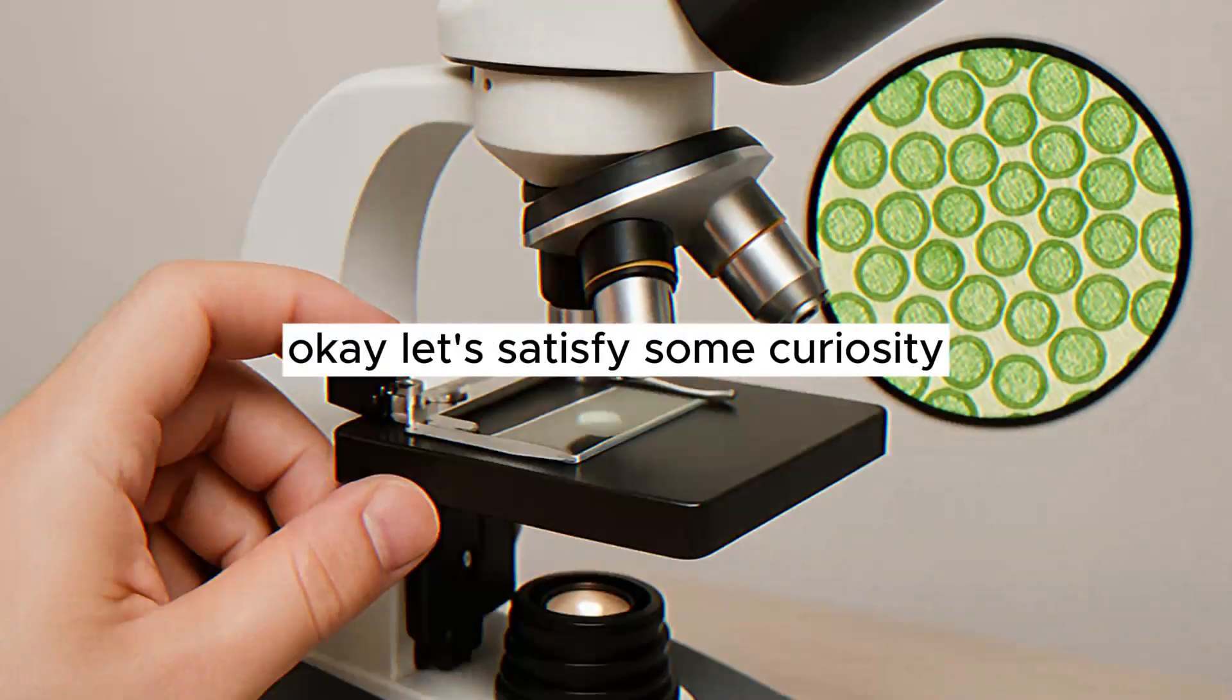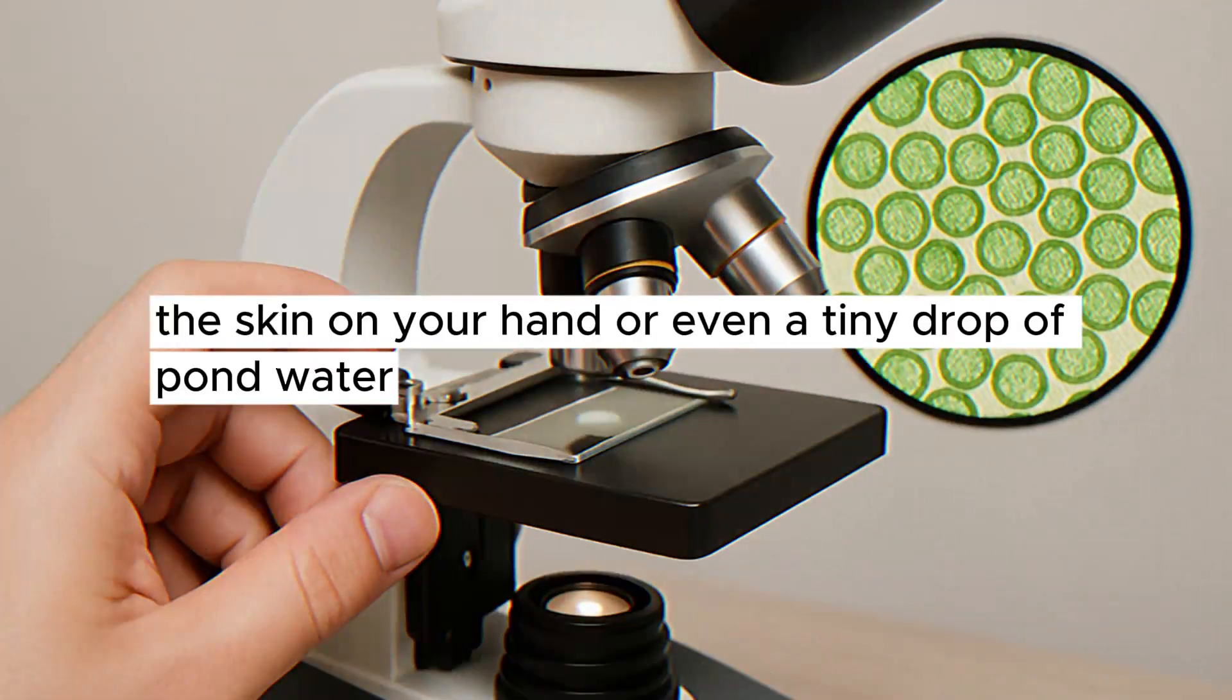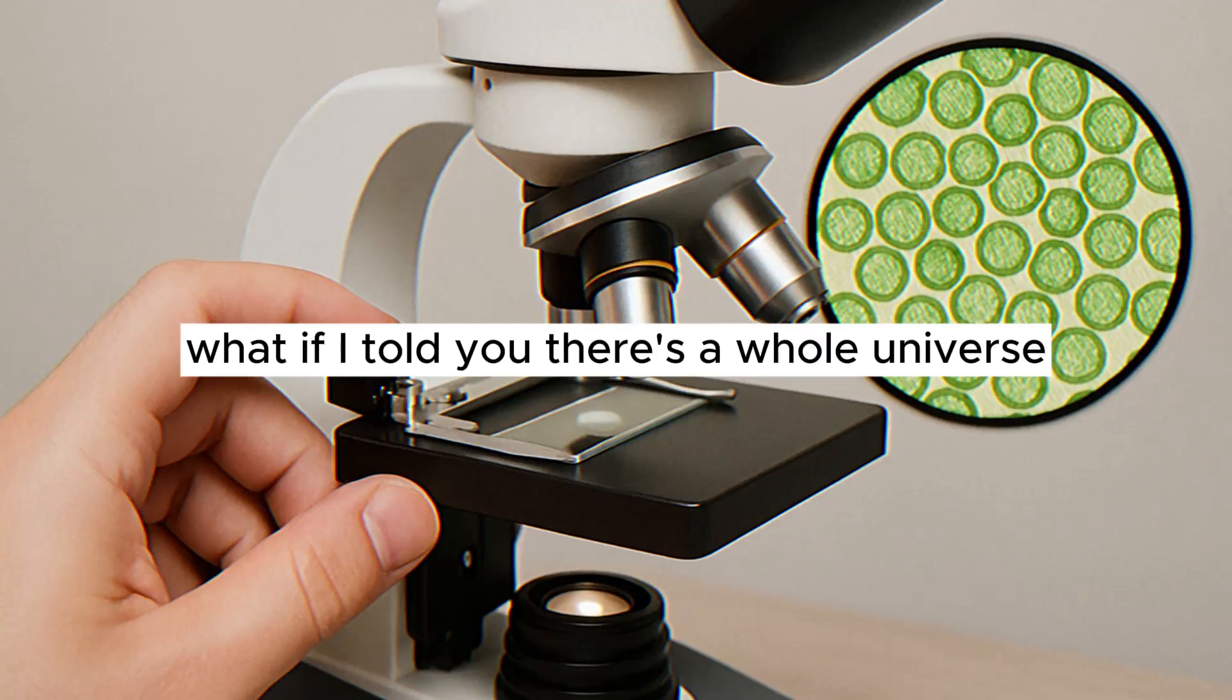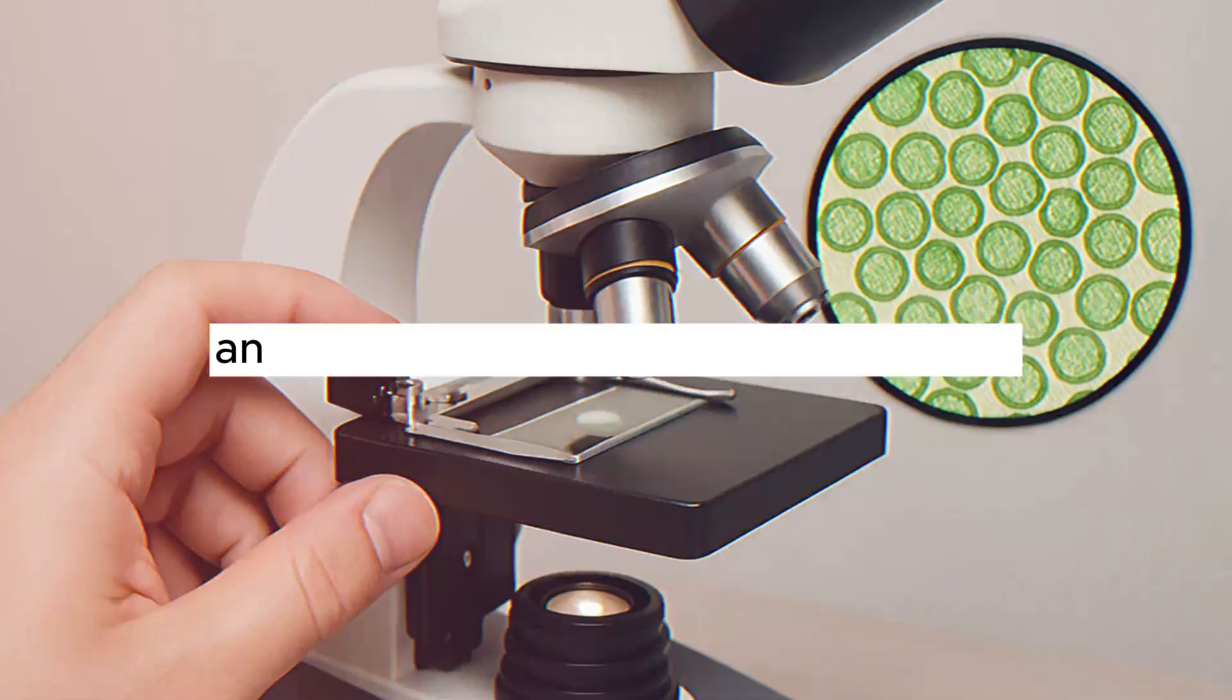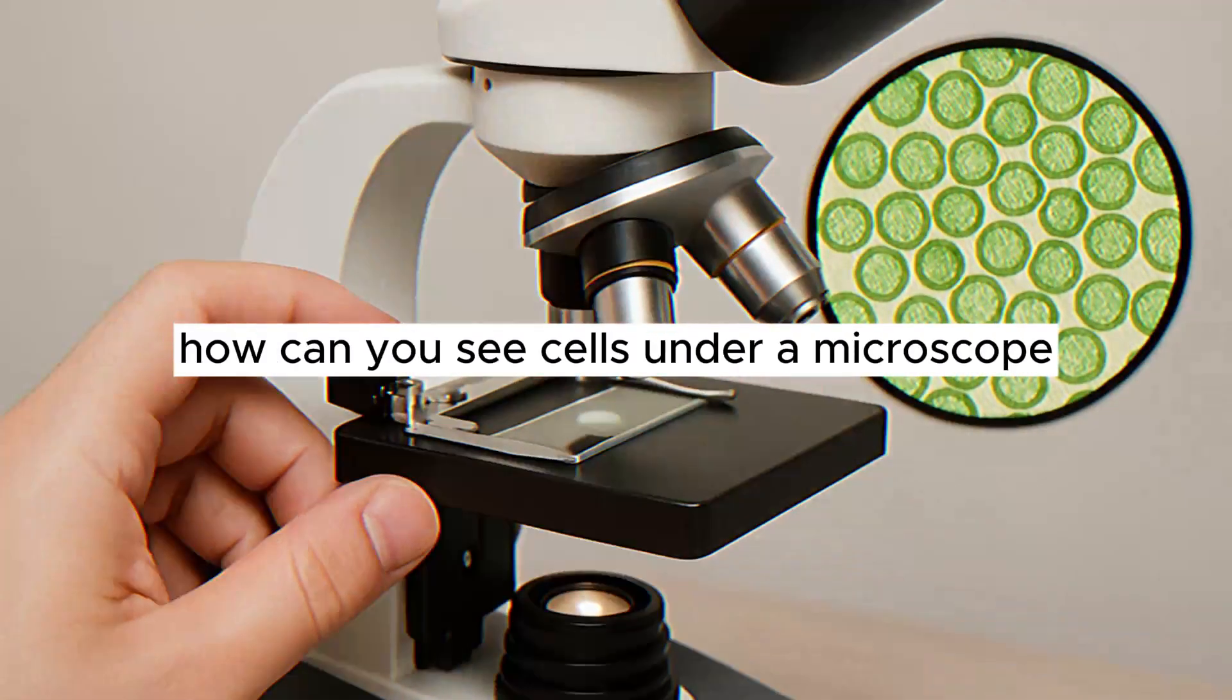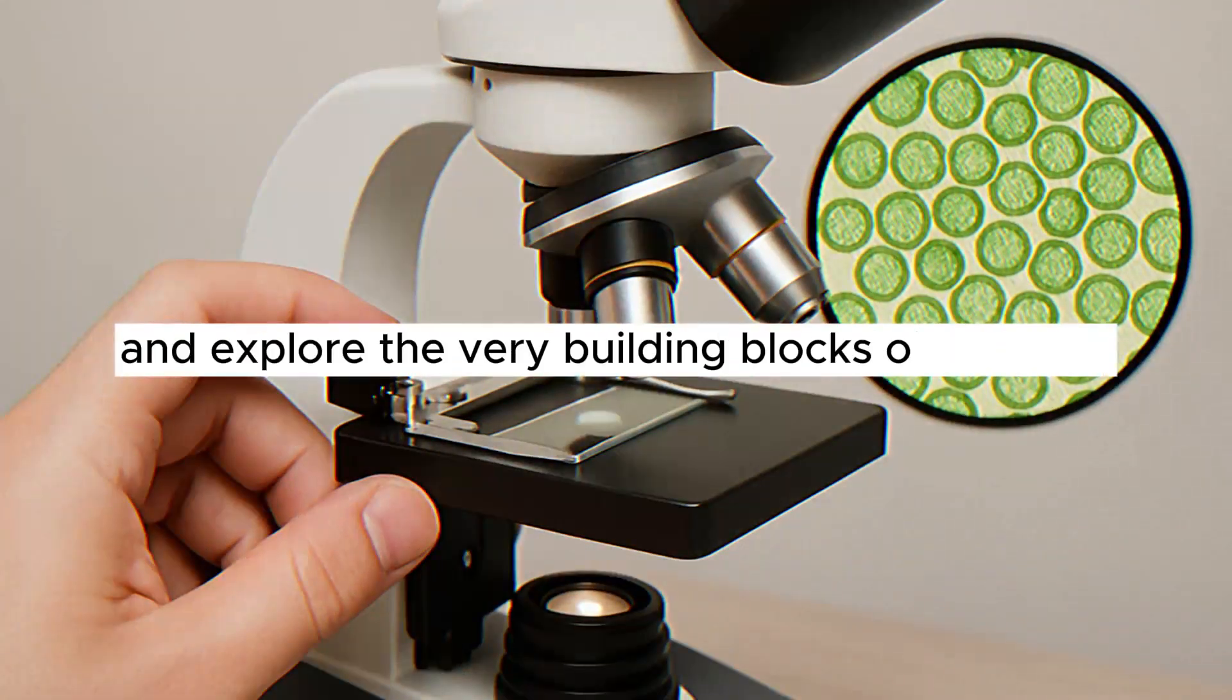Okay, let's satisfy some curiosity. Have you ever wondered what makes up the leaf of a plant, the skin on your hand, or even a tiny drop of pond water? What if I told you there's a whole universe teeming with incredible structures, completely invisible to our naked eye? That's right, today we're unlocking the secrets of the microscopic world and answering a fundamental question: How can you see cells under a microscope? Get ready, because we're about to shrink down and explore the very building blocks of life itself.